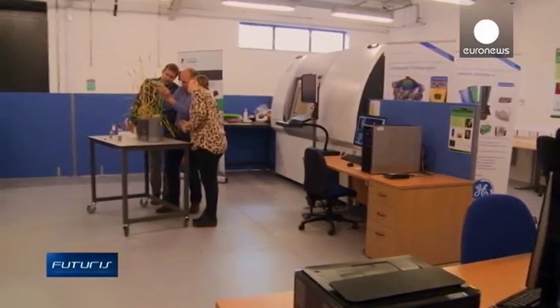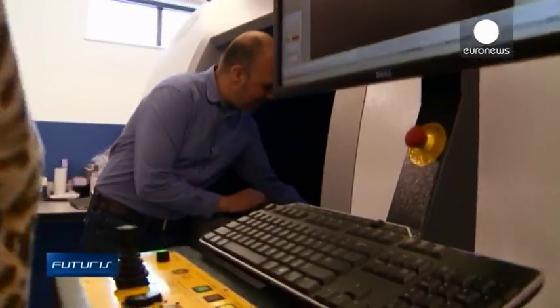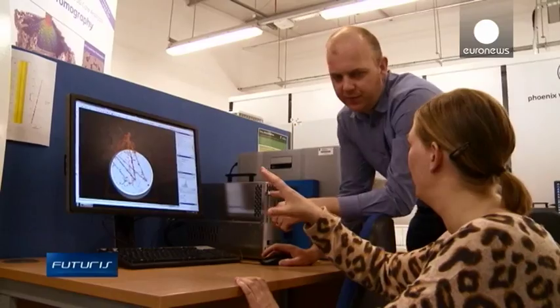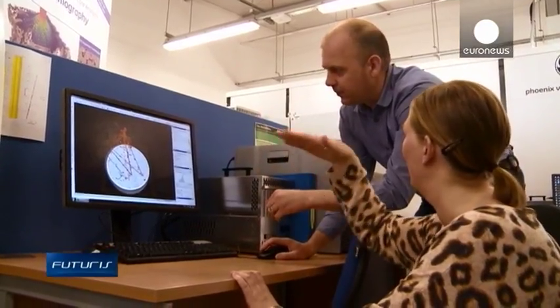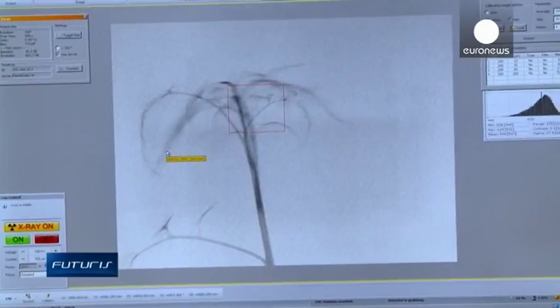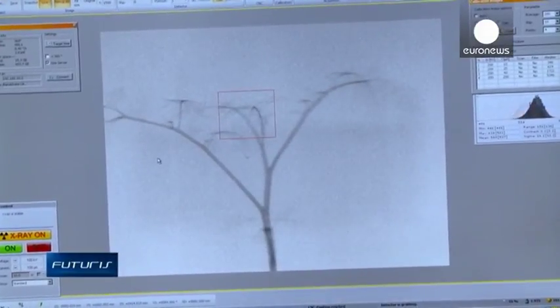Different scanners at this research facility at the University of Nottingham allow scientists to see how the root architectures of different plant species develop over time. It's a similar technology to that used in hospitals. Over the last five years we've moved from maybe a scan taking one hour down to about 10 minutes, so we can shorten that time even further and look at much more dynamic processes of root growth.